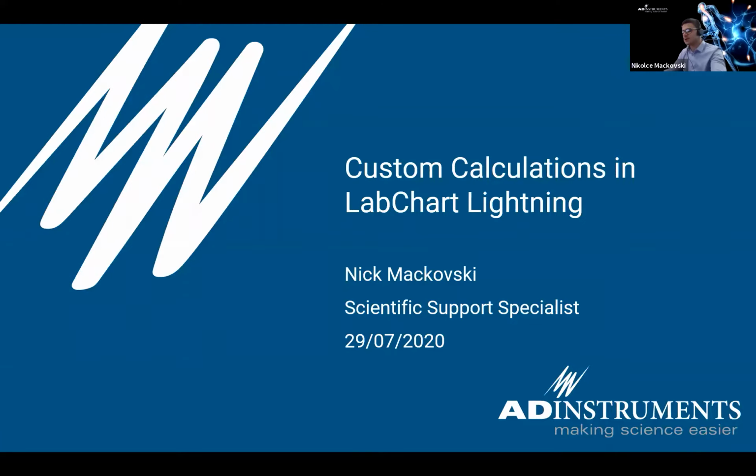We're using this basically to look into how we can tailor this to your data sets, and how we can import calculations and export calculations. There are definitely similarities to calculations that you see in LabChart 8, but there are also quite a few differences, and we're going to explore that today.